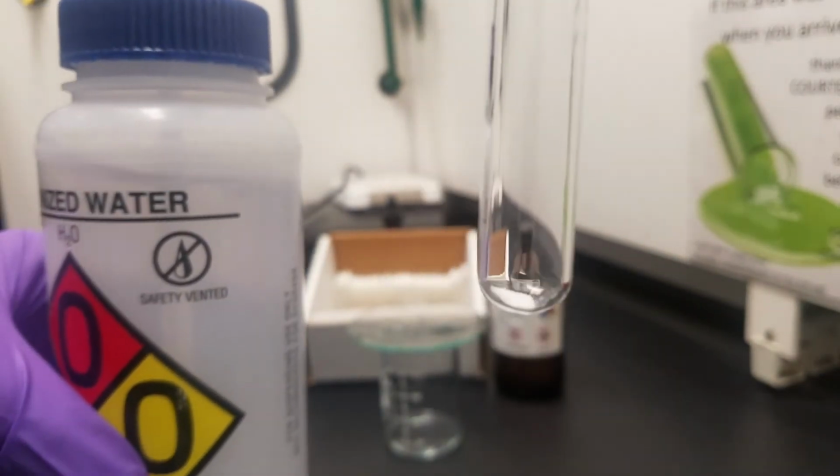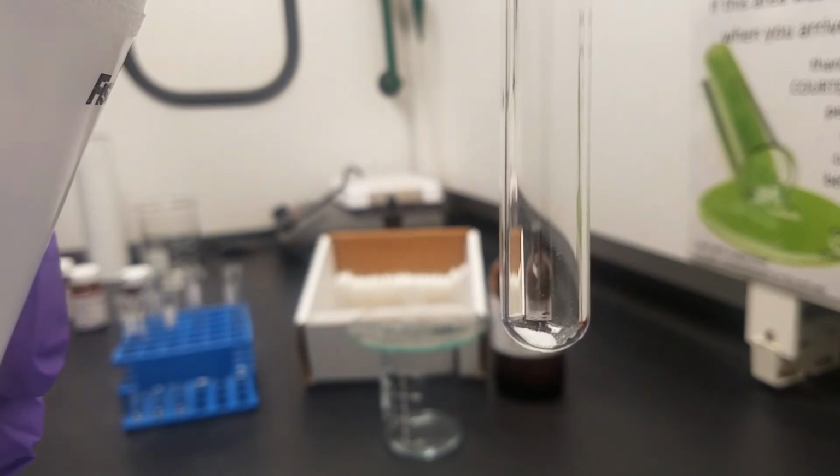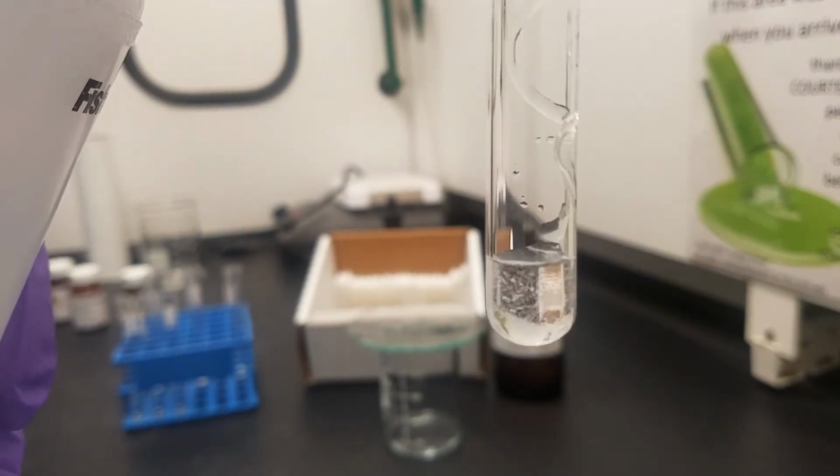So this is our big empty space of just testing these things out. I know that white solid is a little bit difficult to see at the bottom. Do the best you can for the observations. I do try to align that test tube into the black space so it hopefully stands out a little bit more. Okay? So keep your eye on it and do the best that you can. I know we're looking at a video.